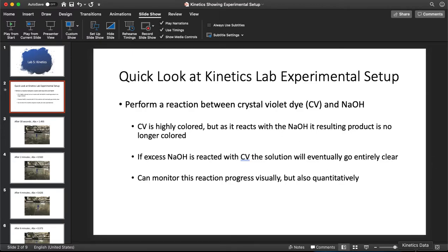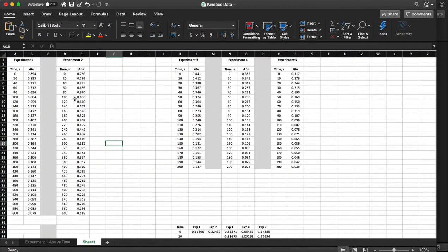Well, from a data standpoint, what we're going to be doing is generating some plots. If you think about kinetics and have gotten a chance to talk about kinetics, particularly in your lectures, one of the things you'll find out is that you have these integrated rate laws, right? And you have integrated rate laws for 0th, first, and second order. For 0th order, you find that your concentration and time have just a linear relationship to each other. But if you look at first and second order, you don't. First order is a natural log relationship. Second order is then a 1 over concentration relationship to how it changes with time. And from this, we can actually make a couple plots.